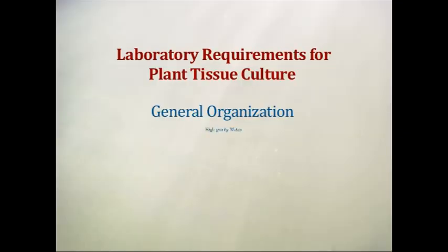The second requirement is high purity water. High purity water like double glass distilled water or deionized water are used in tissue culture procedures. Water should be used immediately and stored water is not preferred.